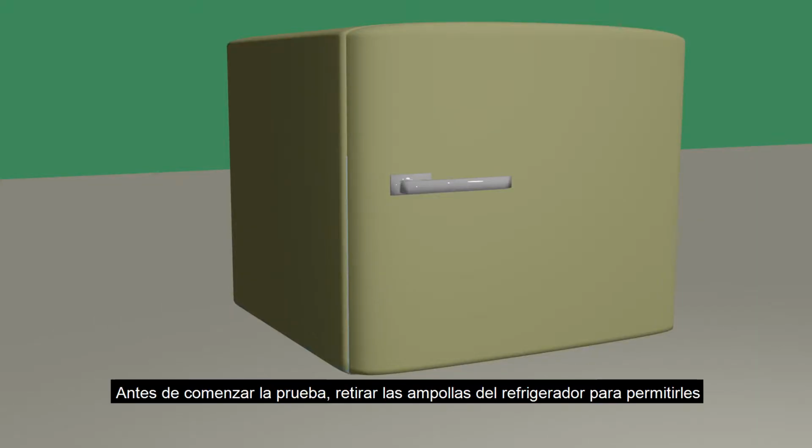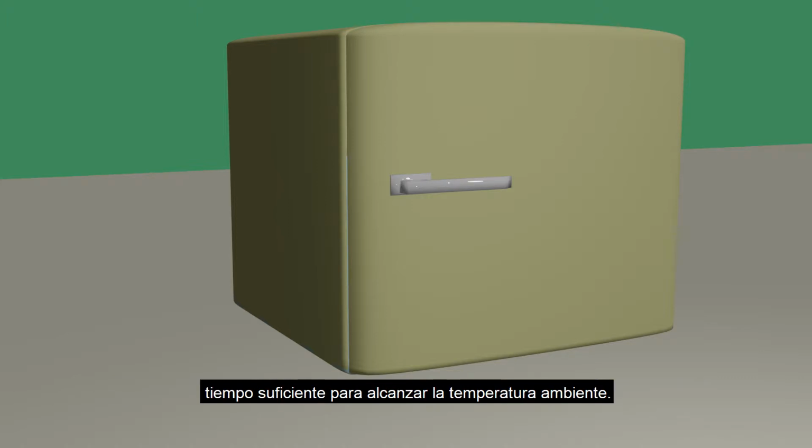Prior to beginning the test, remove your ampules from the refrigerator to allow them sufficient time to reach room temperature. This takes approximately 30 minutes.